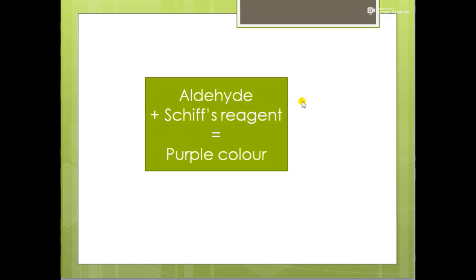So that's how you are able to visualize DNA when you stain it with Schiff's reagent after acid hydrolysis. If you do not do acid hydrolysis during the staining technique, aldehydes will not be formed, and then the detection of DNA would not be possible.